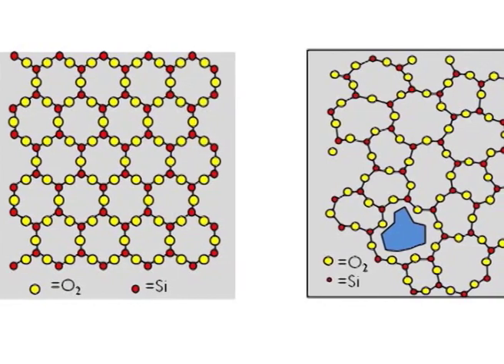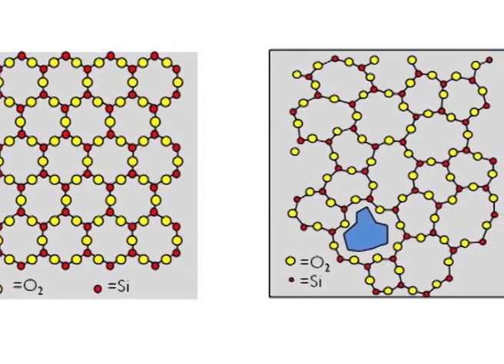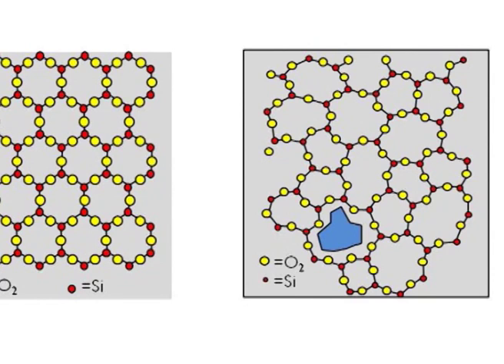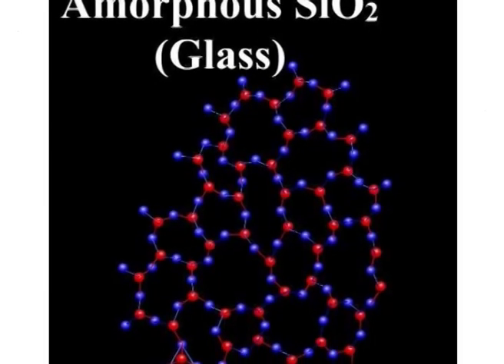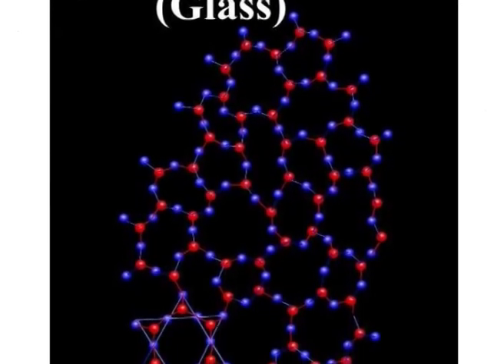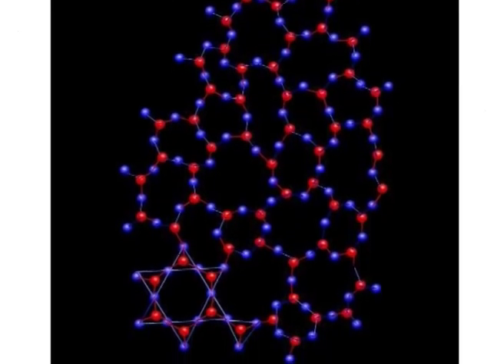The need for single crystals. In order to carry out detailed X-ray structure determination, it is essential to have a crystal of the material in question. Many compounds cannot be crystallized and thus are not amenable to diffraction studies. There are also commercially important materials such as glasses and many ceramics which owe their unique properties to their amorphous nature. Being amorphous, with no long range order, the structures of these materials cannot be investigated in detail by diffraction techniques.